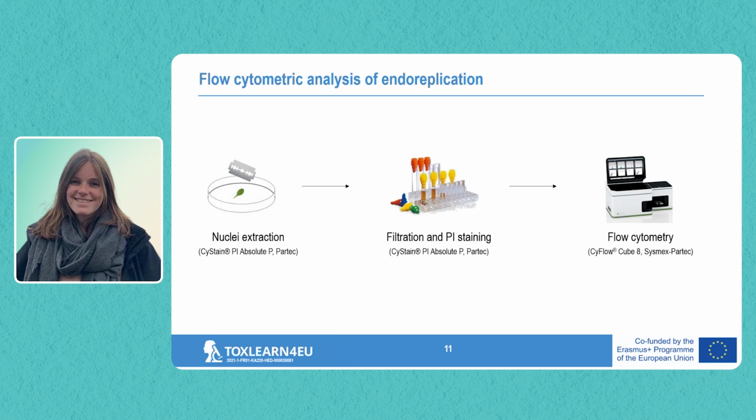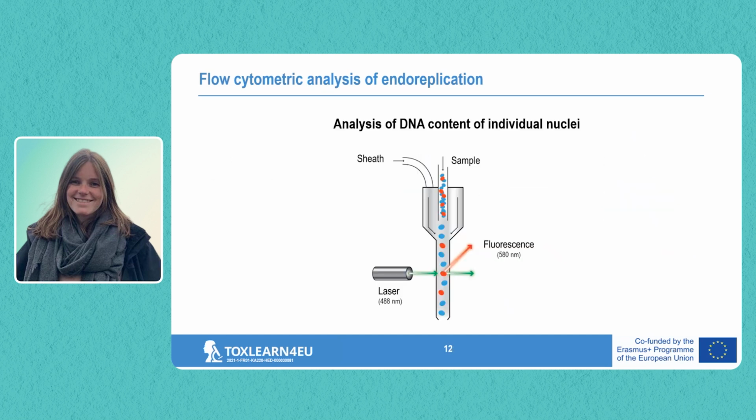And then we will perform flow cytometry, and this is the device we have in our lab at Hasselt University. Then what will happen inside the flow cytometer? Carla already nicely explained this. Actually, it's exactly the same figure.